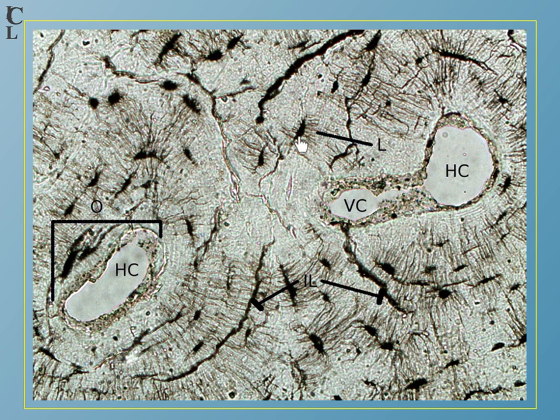Here also we have the ground compact bone. This is the lacuna, and these are the canaliculi. This is the Haversian blood vessel in the Haversian canal, and this is an anastomosing blood vessel from one canal to another. It is present in what is called Volkmann's canal. So this is the Volkmann's canal, and this is the Haversian canal.